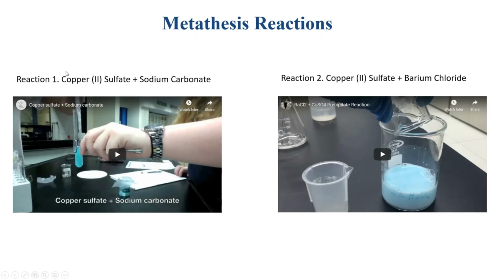And the reactions of copper are really interesting because we know from experiment 4, where we did the redox reactions, that copper 2+, which is what the copper we're using here is, has a blue color. And that's just going to allow us to track whether the copper is in the supernatant or in the precipitate.